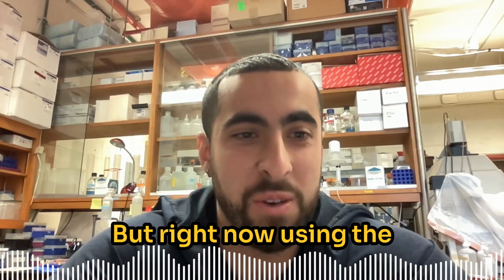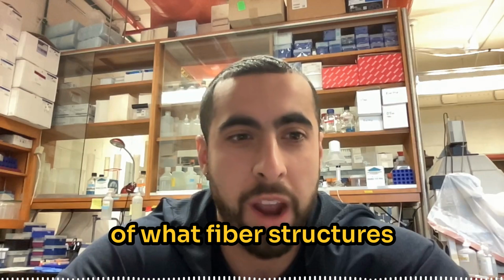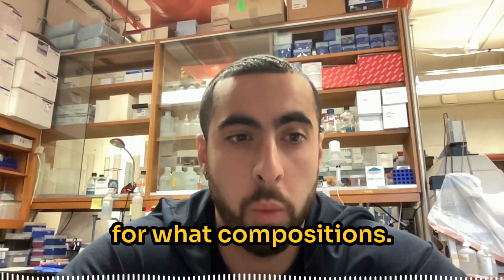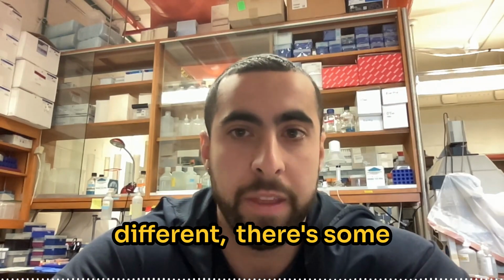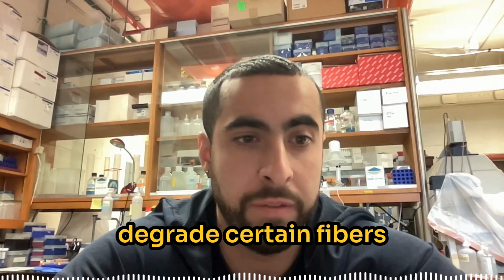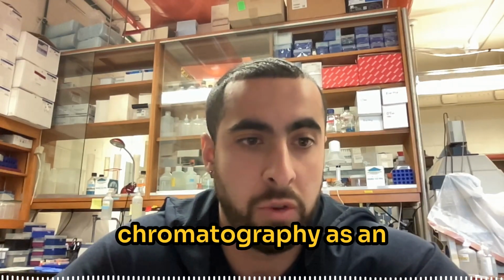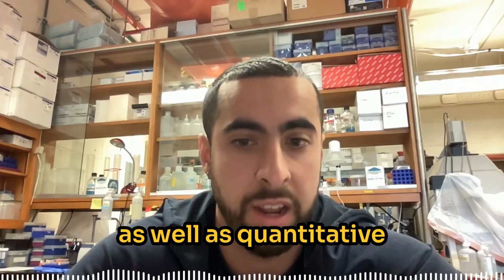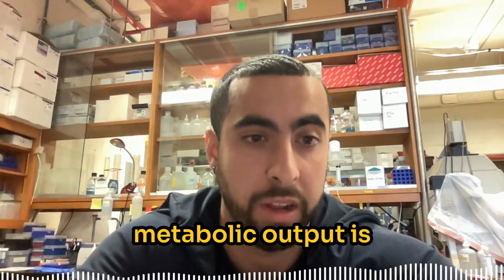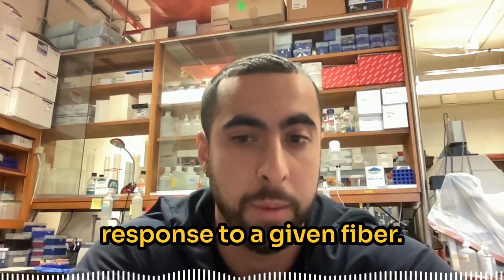But right now, using the targeted approach, we could get a better idea of what fiber structures seem to work better for what compositions. So since human gut microbiomes are different, there's some microbiomes that degrade certain fibers better than others. And using GC-MS or chromatography as an approach, we could get a good qualitative as well as quantitative idea of how much metabolic output is happening by these gut microbial communities in response to a given fiber.